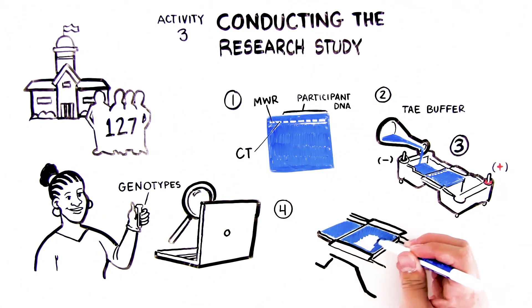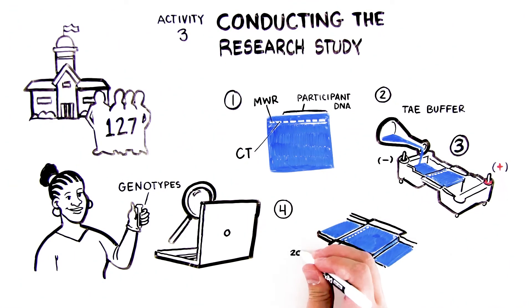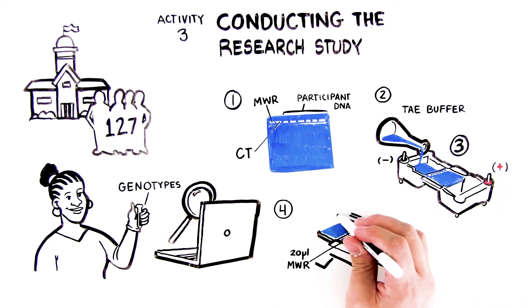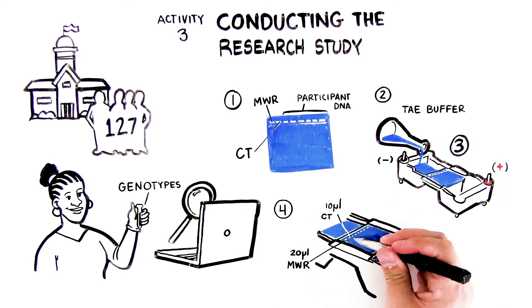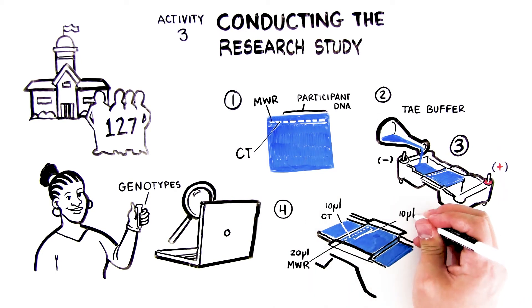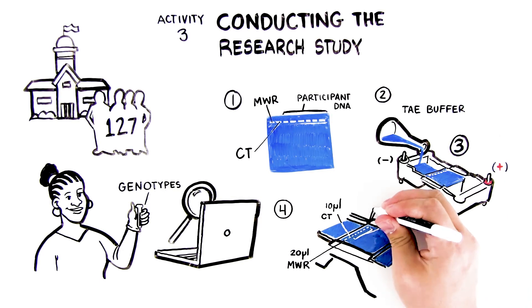Load 20 microliters of MWR in lane 1, 10 microliters of CT, controlled DNA, in lane 2, and 10 microliters of the DNA from assigned participants in lanes 3 through 8.